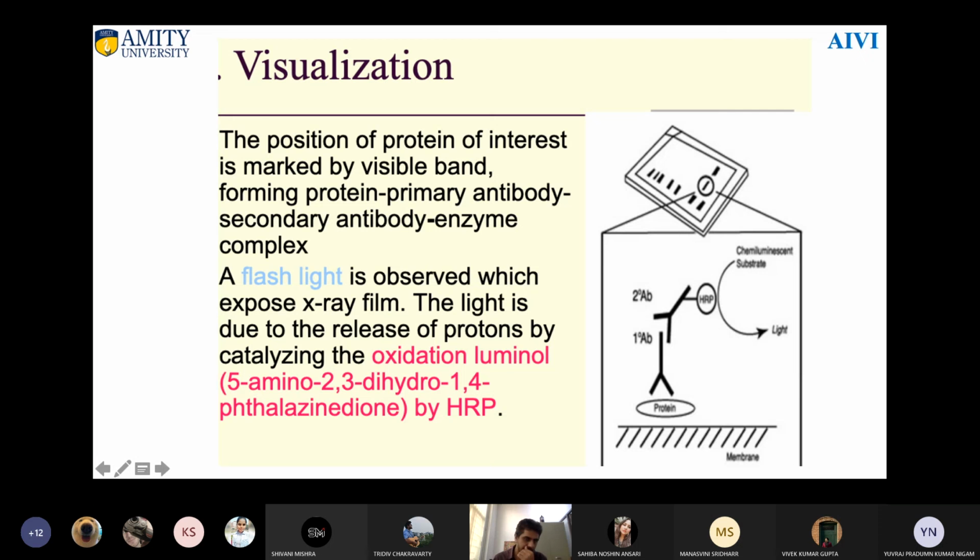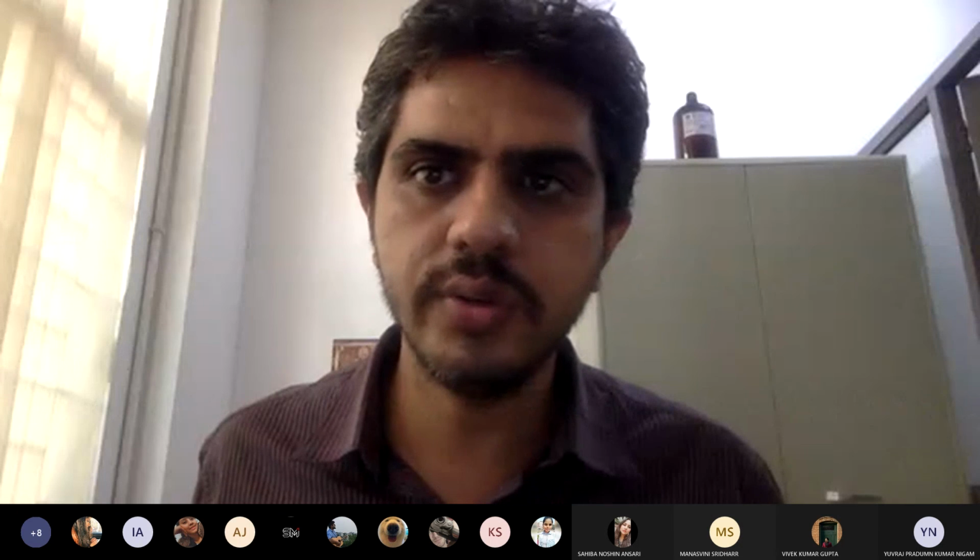So by this, we are done with all the types of hybridization of the protein, Northern, Western. Now before closing and before coming to you for the questions, I would like to show you some video also, where you can really see how we perform this experiment. So just wait for a moment, I will share the video.